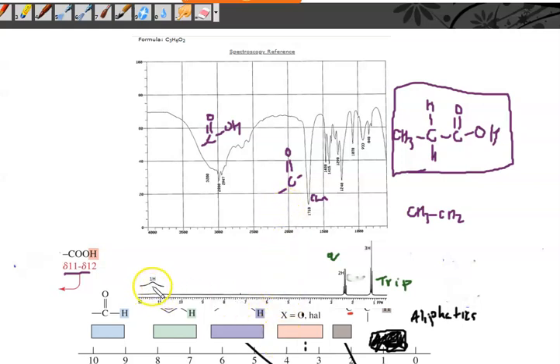It's actually amazing that normally you can't see carboxylic acid peaks on an NMR. You see how in the actual NMR it is so flat. You can barely see it, but if you blow it up so much, you can actually see something. Remember yesterday I talked about if you have hydrogen bonding, it's hard to see. It's actually spread over a larger area. So usually you don't see a carboxylic acid peak. You have to take the IR to clearly see it's a carboxylic acid or an alcohol. Okay? So you guys got any questions on that, or is that good?